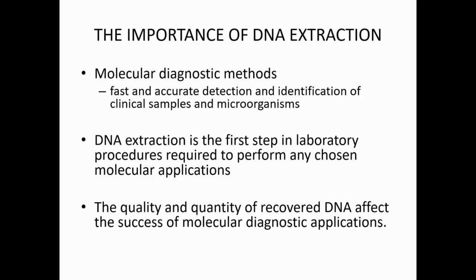As you may have heard a lot, one is the PCR, real-time PCR, and then also the next generation sequencing. All these techniques require the extraction and purification of the nucleic acid. So that's why the DNA extraction and DNA preparation is so important.